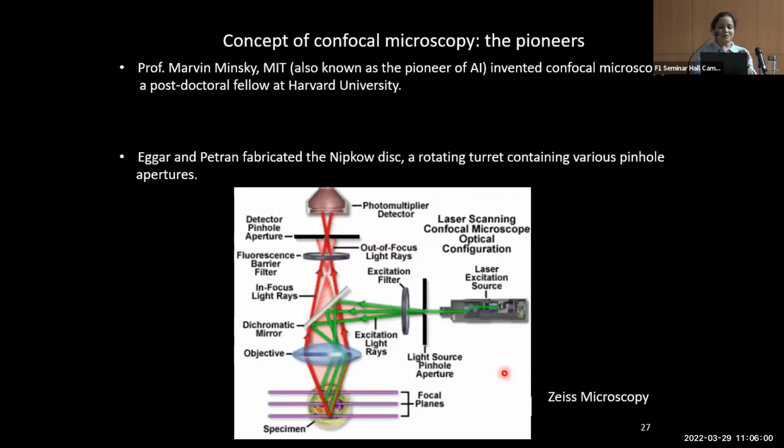Okay. All right. So before going, we have from confocal. So this was fluorescence. Now we do fluorescence with epifluorescence, confocal, and 2-photon microscopes. So the latest in technology, I will... Why do we use confocal? Why don't we use epifluorescence?